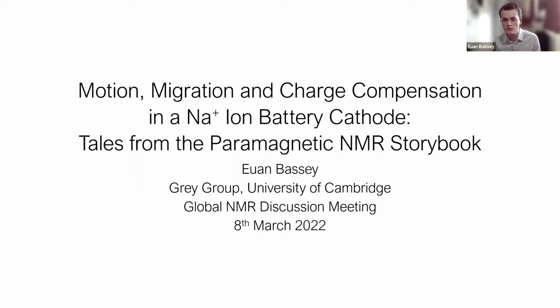Today I'm going to be showing you exactly how NMR can be used to study sodium-ion cathodes and what kind of information we can obtain using, in particular, paramagnetic NMR. We're going to look a little bit at the background of some paramagnetic NMR before actually going into examining some real spectra and identifying what kind of information we can get out of it.